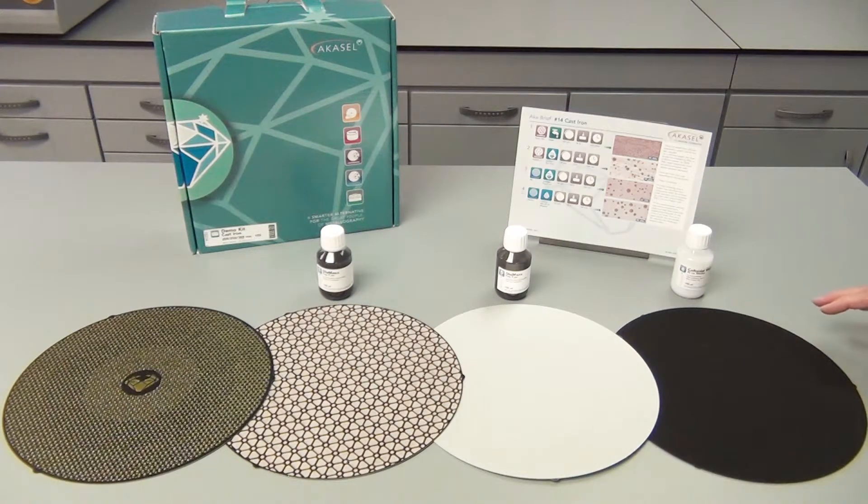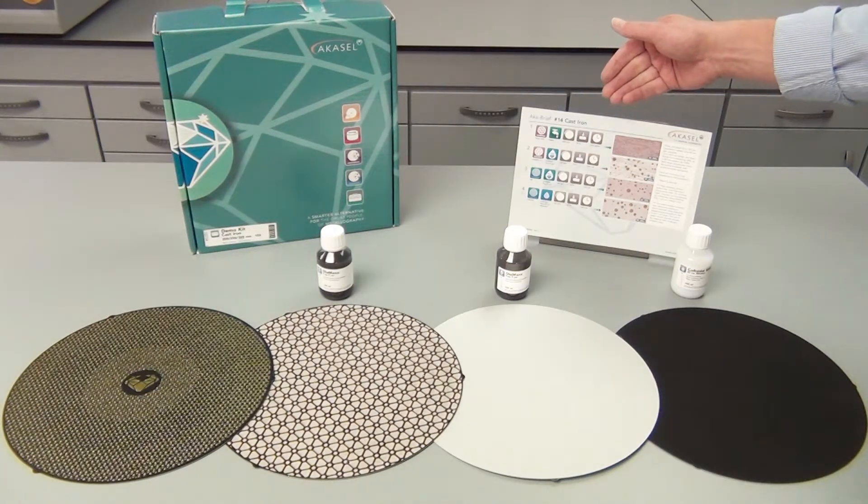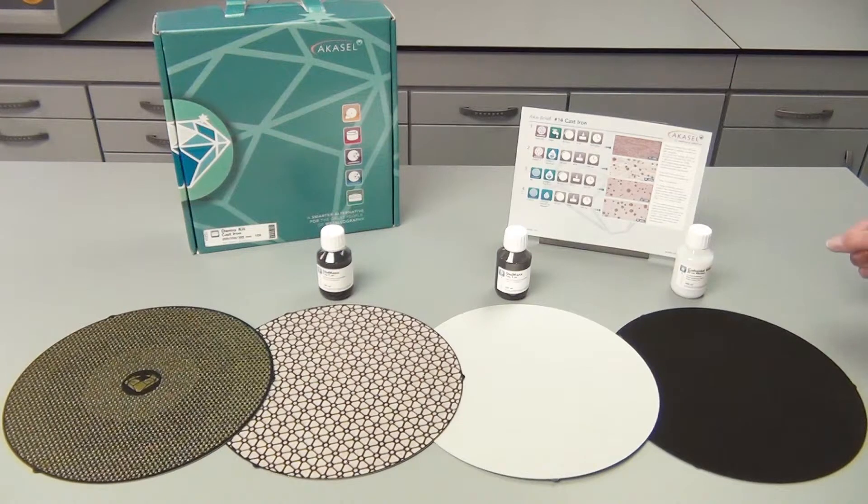With these consumables, you can run the entire preparation method several times to try to see if it makes the perfect result also for your samples. And here on the preparation sheet, you have the details on how to use each and every consumable — for how long you should grind and polish, the forces you should use, and so on.